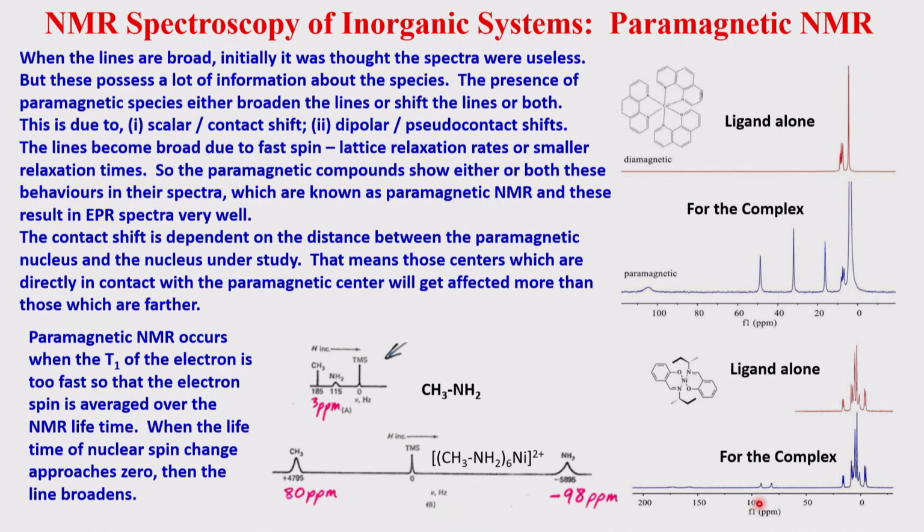So you can get minus or you can get plus. So generally this broad peak comes from the relaxation rates. I hope that part is somewhat clear to you.